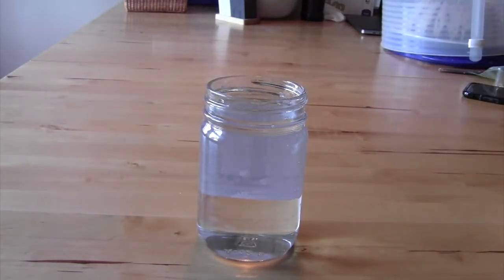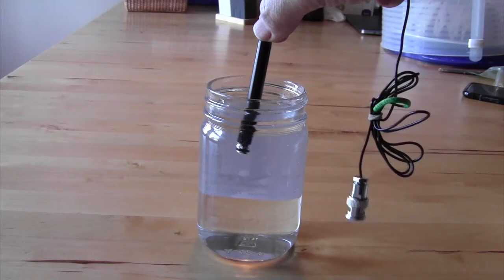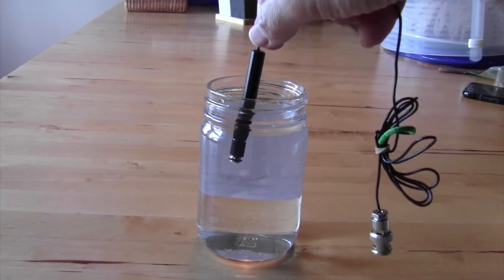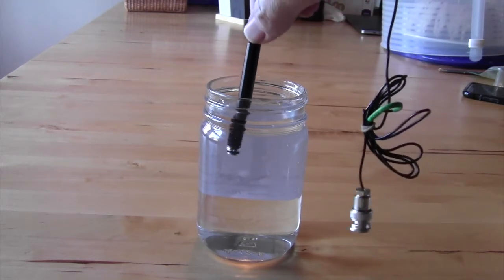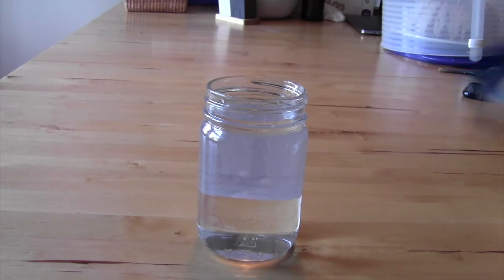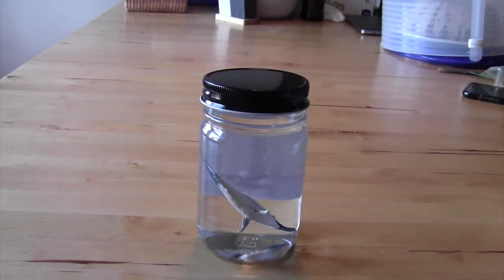Okay, so we have our test jar, and we can measure the oxygen content, the dissolved oxygen, first using a simple oxygen probe like this. Okay. Now, two things generally will give you better results in this experiment. One is if your animals are actually alive, and two is if you plug your oxygen probe into an actual recorder. So measure your oxygen content before, add your specimen, seal it up, and now each jar will go into a different temperature.